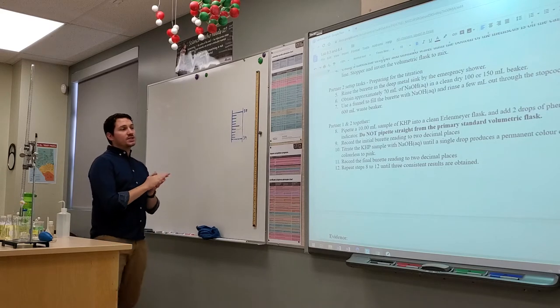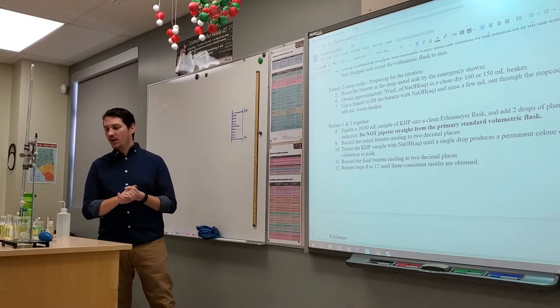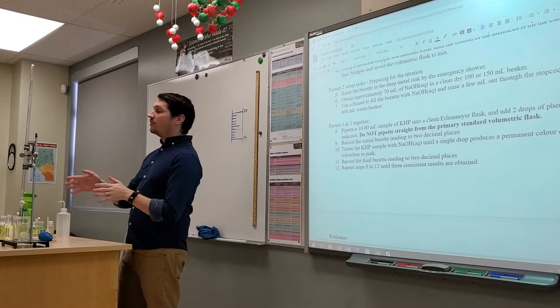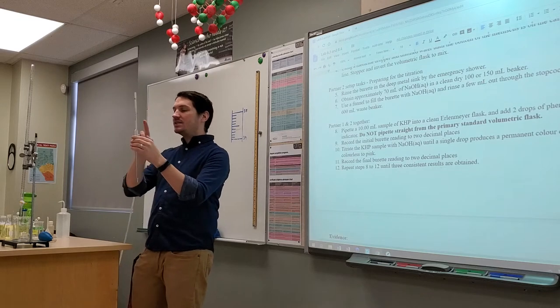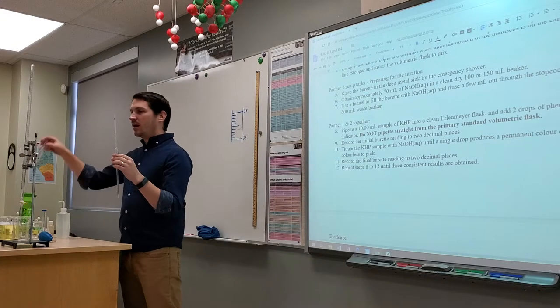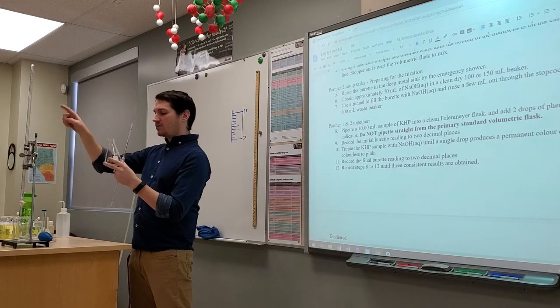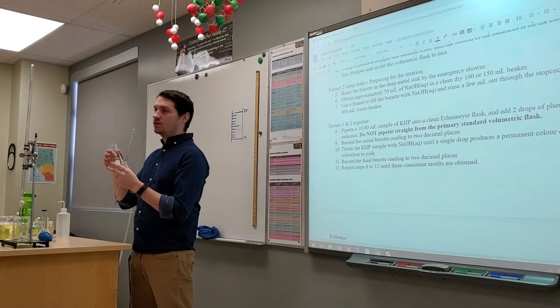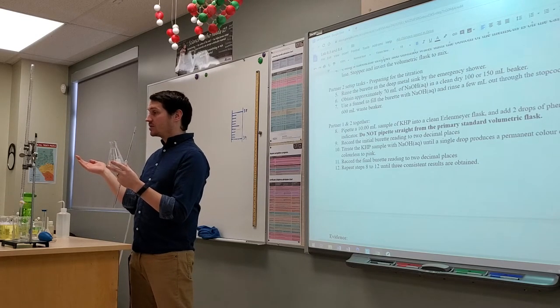Now, what we want to do today is titrate our potassium hydrogen phthalate. We want to titrate our KHP. That's really all we got going on today. All that's involved is basically pipetting out 10 milliliter samples of your KHP into an Erlenmeyer flask, and then adding enough sodium hydroxide so that it neutralizes it or completely reacts it. You're going to do that 4 times, and if you get 3 or 4 good results, then you're fine.